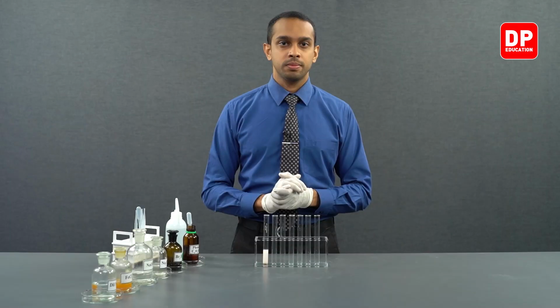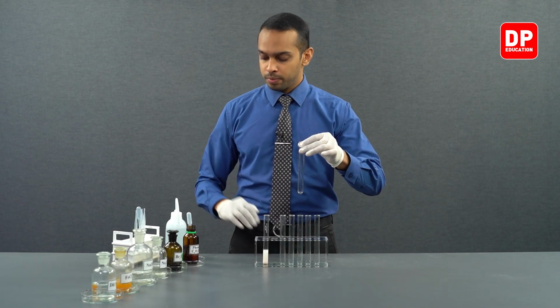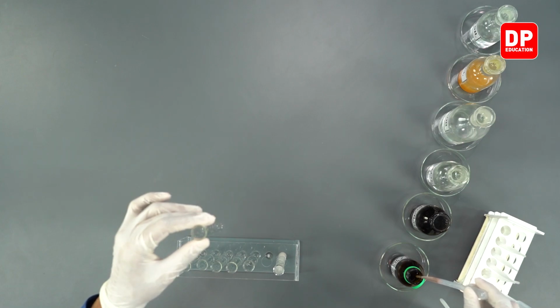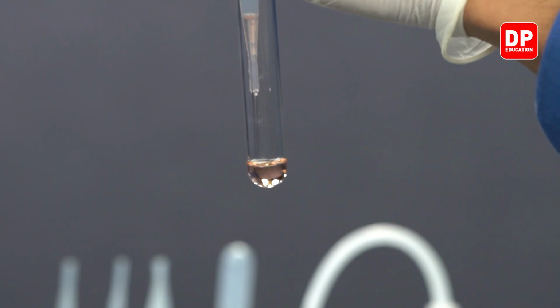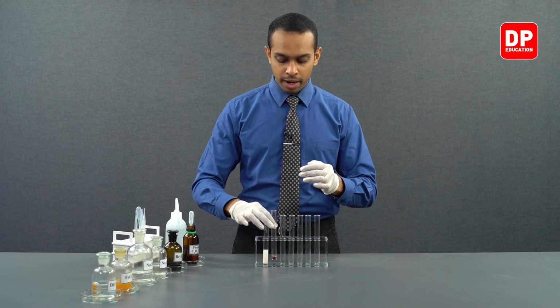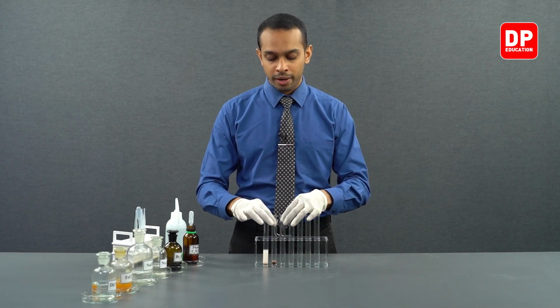In this part of our experiment, we are going to see how bromine or bromine water reacts with phenol. Now, to test this, we will take a test tube and take a small amount of phenol into this test tube. We will use this test tube to add a small amount of phenol into our bromine water because I want to compare the colors of the two solutions you will have.